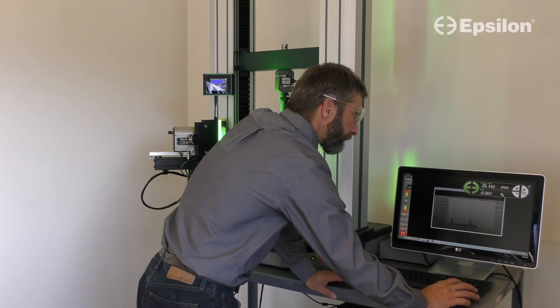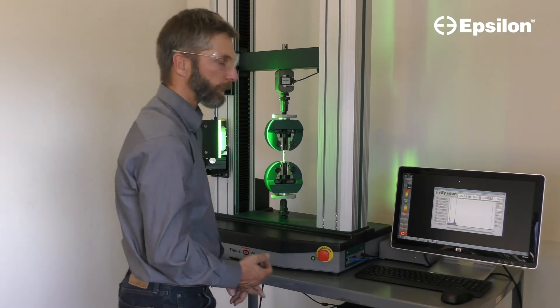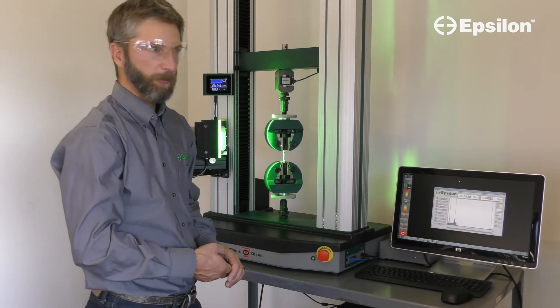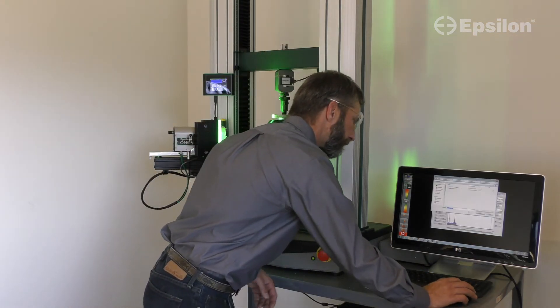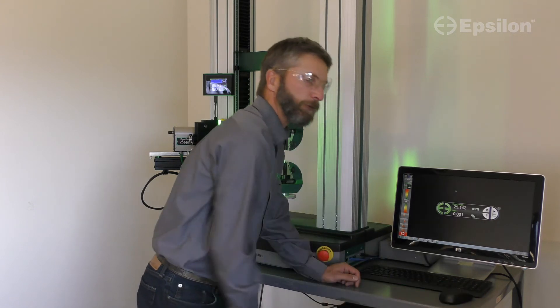To configure a test, we'll go to administrator mode, where we can configure the analog output range, data rate, filter settings, and other test parameters. When you're done with your settings, save that recipe locally and return to the test mode.